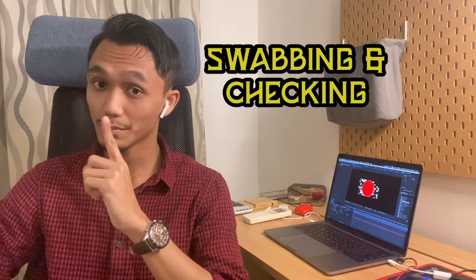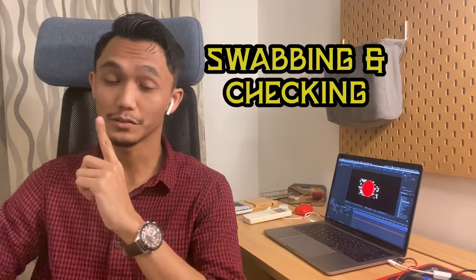When we are finished with all the preparations, we will put all the medications and equipments that we prepared into the pass box. These pass boxes are connected into the CDR preparation room. As trainees or intern students, our job scopes are limited. We help with preparations such as swabbing and checking in the preparation rooms.